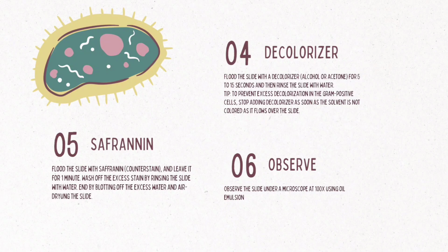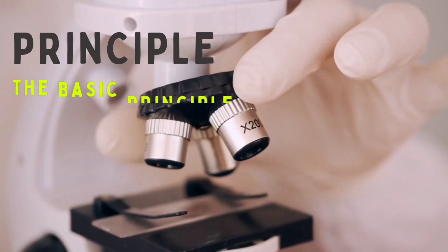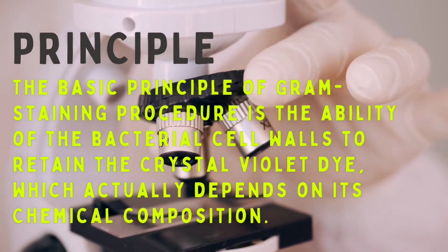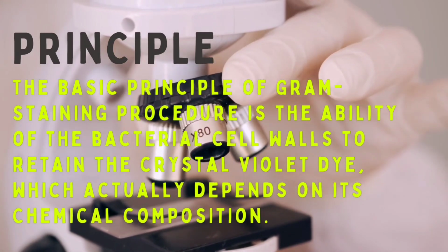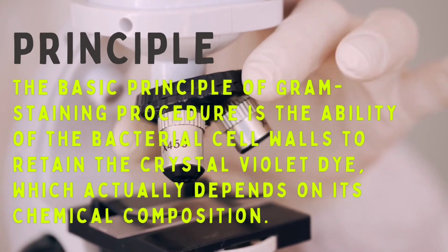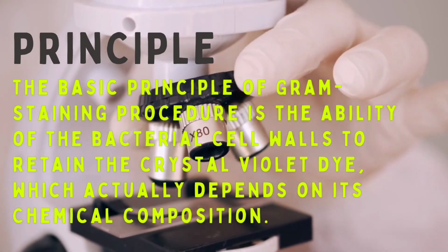The excess stain is washed off again by rinsing the slide with water. The excess water is blotted off using blotting paper, and the slide is air dried. Finally, the slide is observed under a 100x microscope using oil immersion. Moving on to the principle of the gram staining procedure. The principle of gram staining procedure is the ability of the bacterial cell walls to retain the crystal violet dye, which actually depends upon its chemical composition.